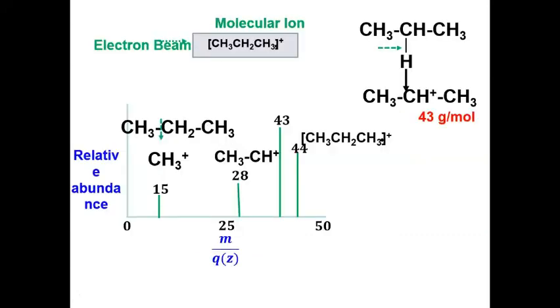These were about the fragmentation of any molecule in mass spectrometry, and for a particular molecule we will have some specific fragmented peaks. That is, we can say, a fingerprint of any molecule, and based on that fingerprint of fragmented ions, the mass spectrometer decides the identity of the molecule.